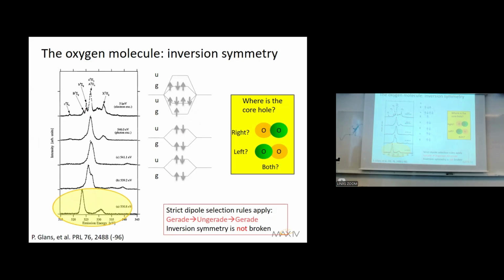If I excite on the next one, that means that I then go with this one all the way up from the gerade to ungerade. I now separated the core levels, but they're not really separated in real life. Energy-wise, it's hard, but because I have these ungerade and gerade different excitations available to me, I can discern them anyway.